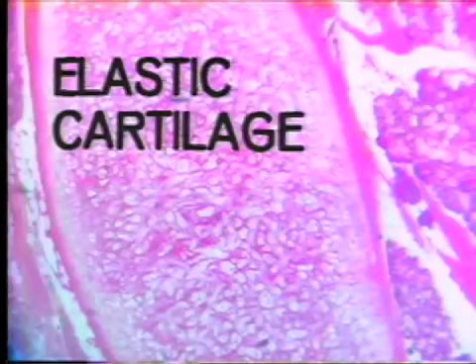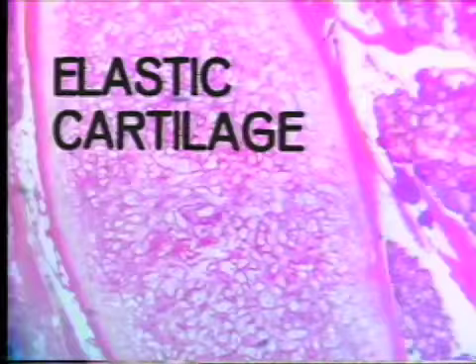On this low power section now of elastic cartilage, we see the perichondrium on the outside, many cartilage cells, rounded cells, and you can pick up the brilliance of the elastic fibers interspersed around the cartilage cells. Now let's go to the next power. Perichondrium is on the right, and elastic cartilage here. See the brilliant appearance of the elastic fibers?